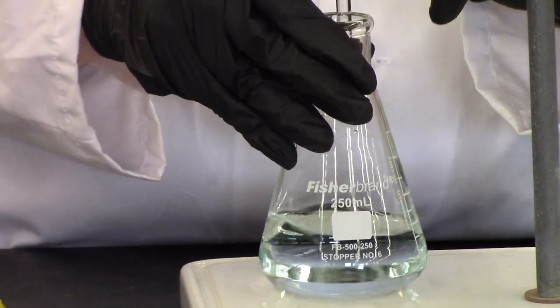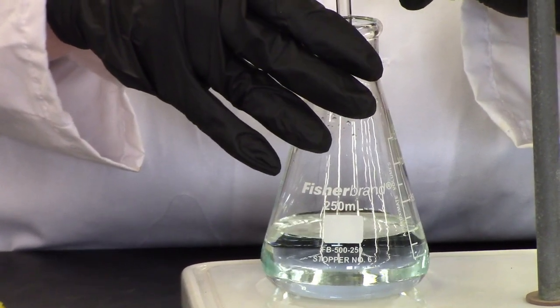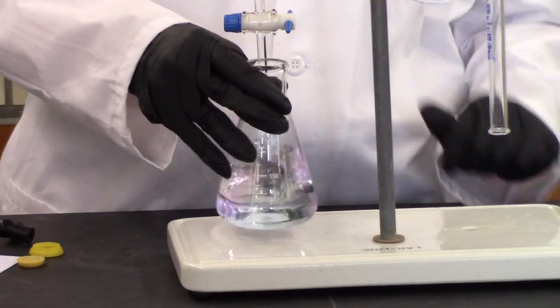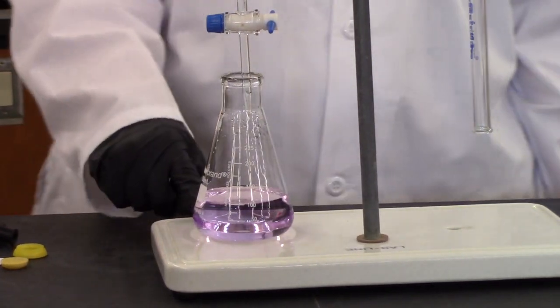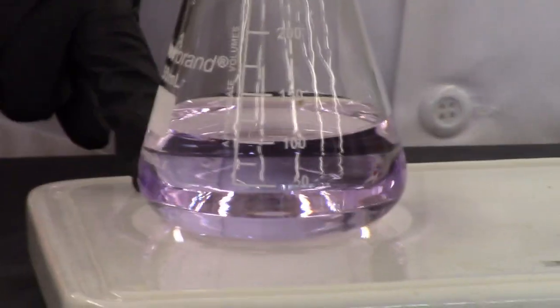So you'll notice that the pink cloud is persisting longer and longer as we go along. That means it's getting closer and closer to the end point. So again, just a reminder, the end point is when the acid and base neutralize, the H plus and the OH minus. So you see what happened there? It was just one or two drops. And it turned. I'm trying to get to that exact point. So this is a pale, pale pink. This is an ideal end point here, right?